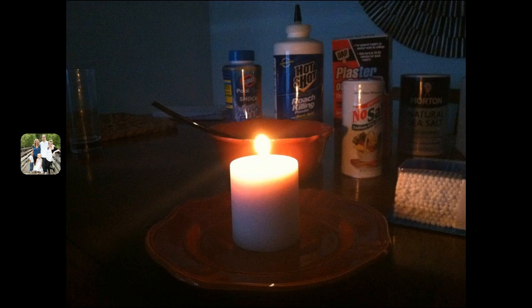My research question for the experiment was, how does the type of metal in a chemical affect the color produced when it is heated in a flame? My hypothesis statement was that I believe from my background in chemistry that the types of metal in a chemical will change the colors of a flame when heated within that flame.